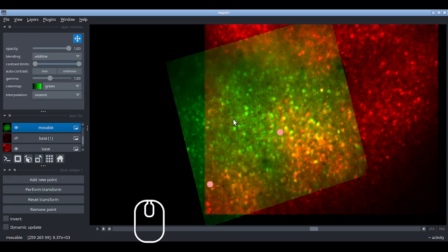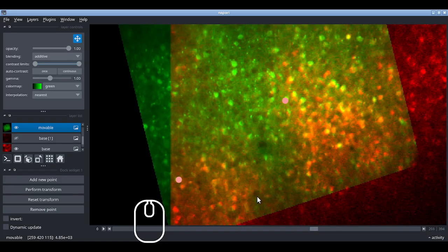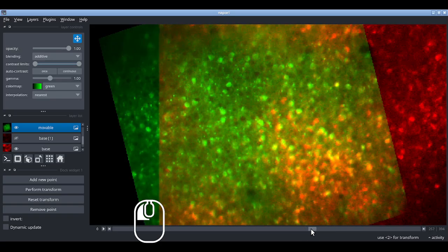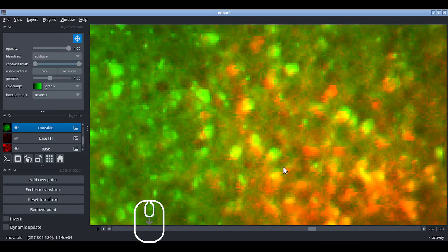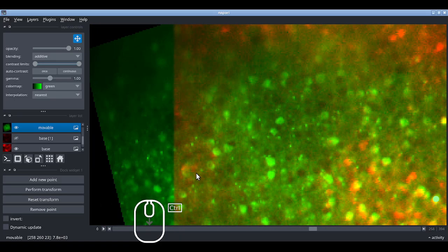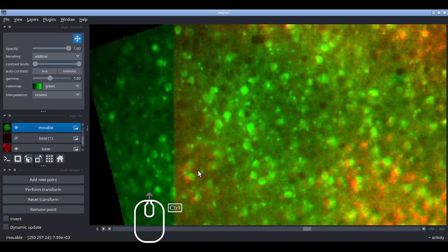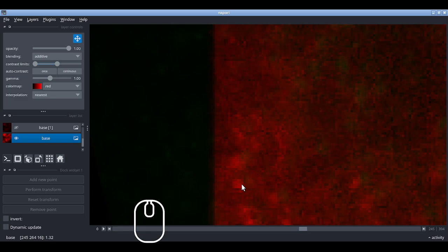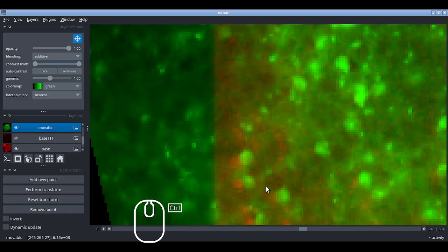So this is where the nonlinear piece comes in, because this isn't good enough. It's not very good, or this one, or any of these really. They're just not very strong. Let's grab one over here, just while we're here.